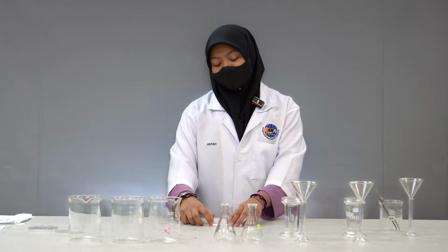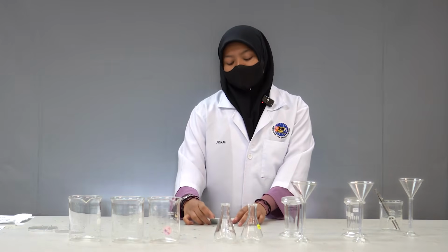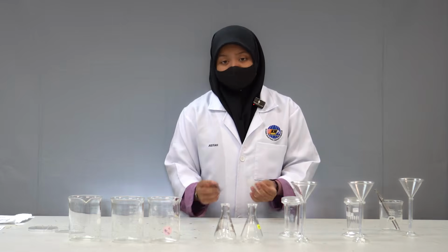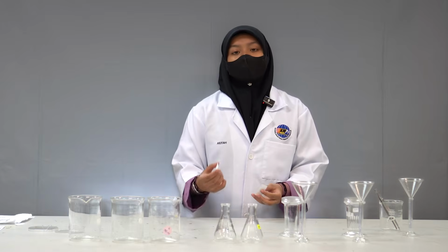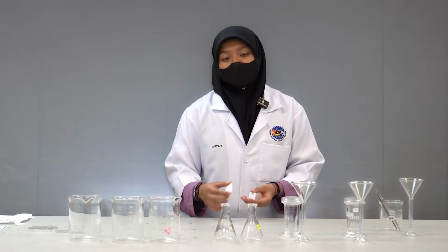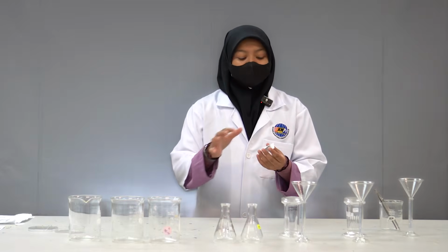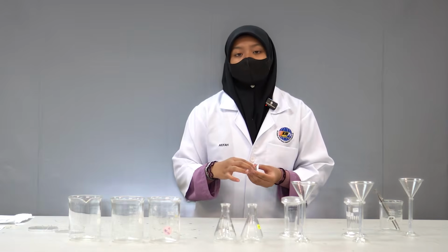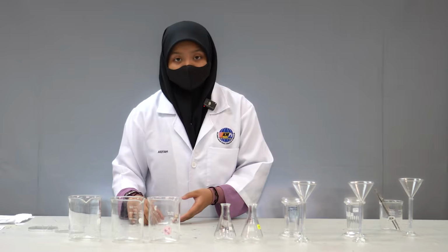Okay, from harming us. So as the result, we can see on both of these thin layers, the result will show us based on the RF value, which indicates their polarity and the movement of the solution through the silica. So I think that is already the end of my section, which is the procedure. So I will pass to my next presenter.